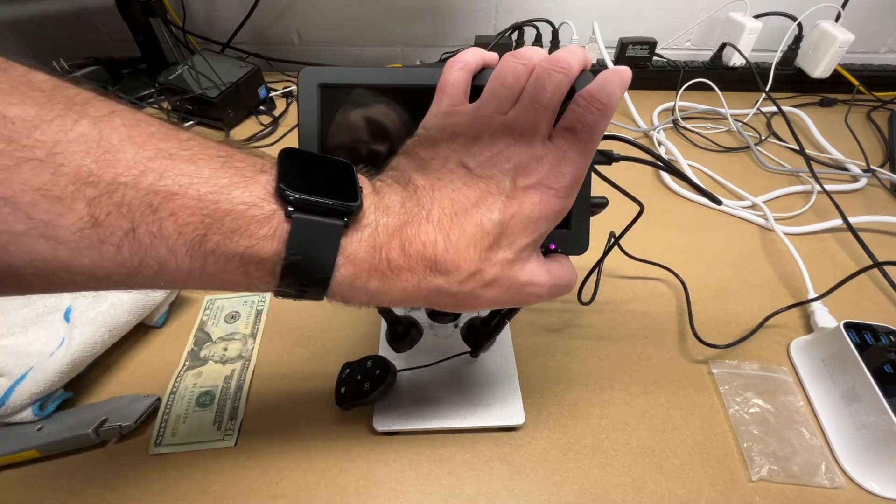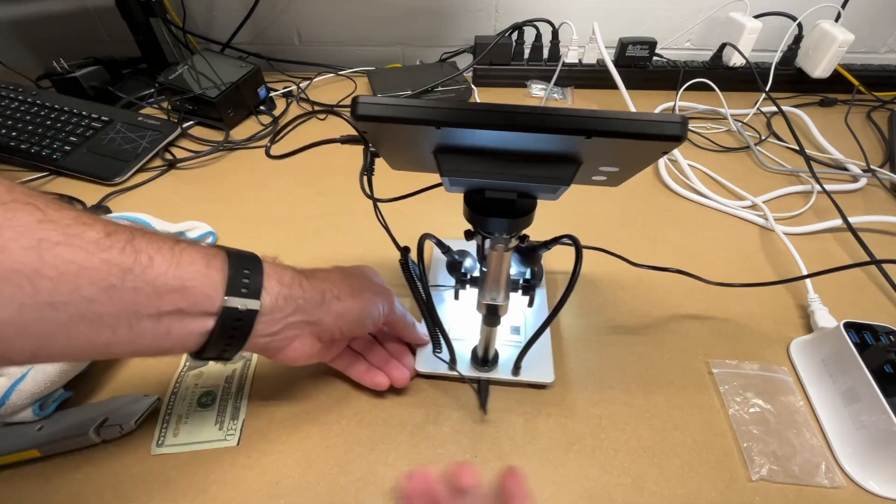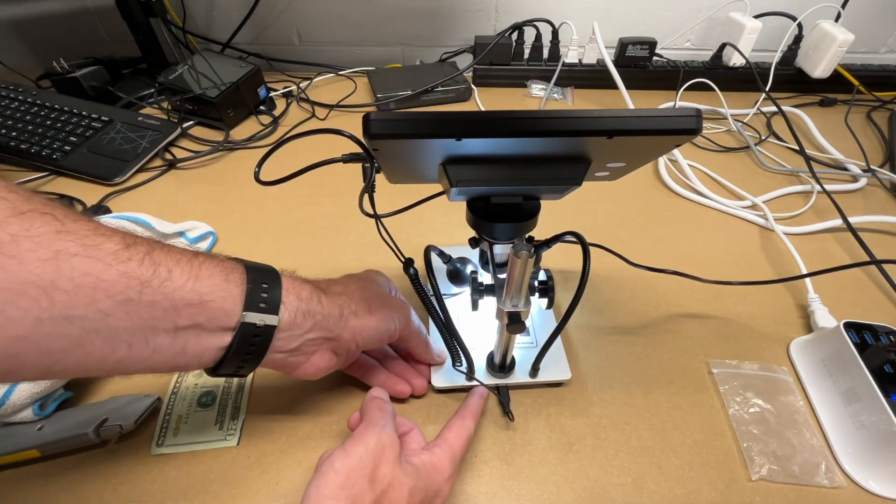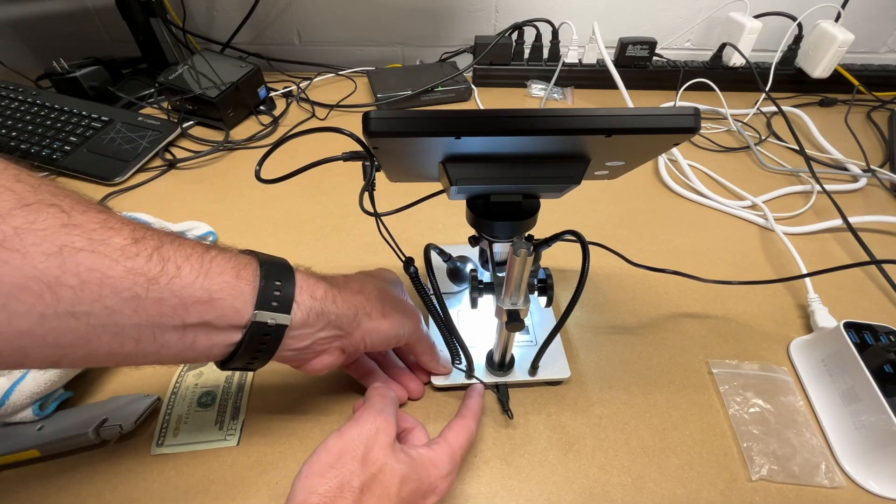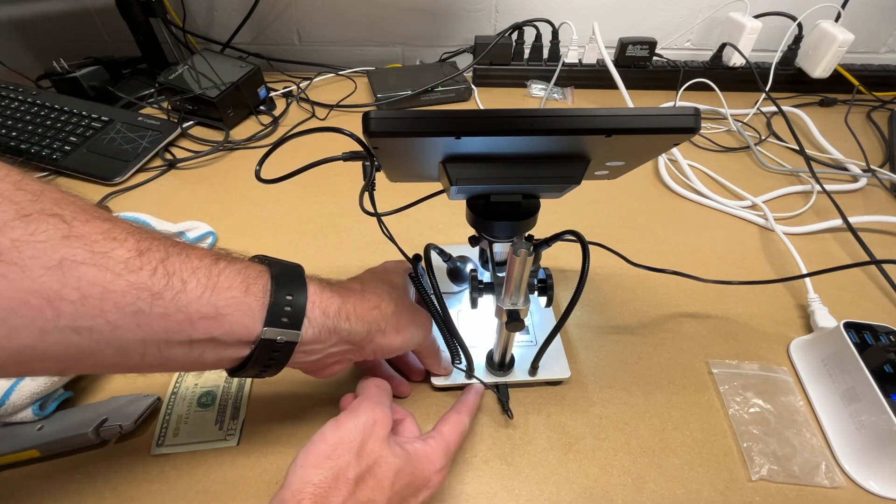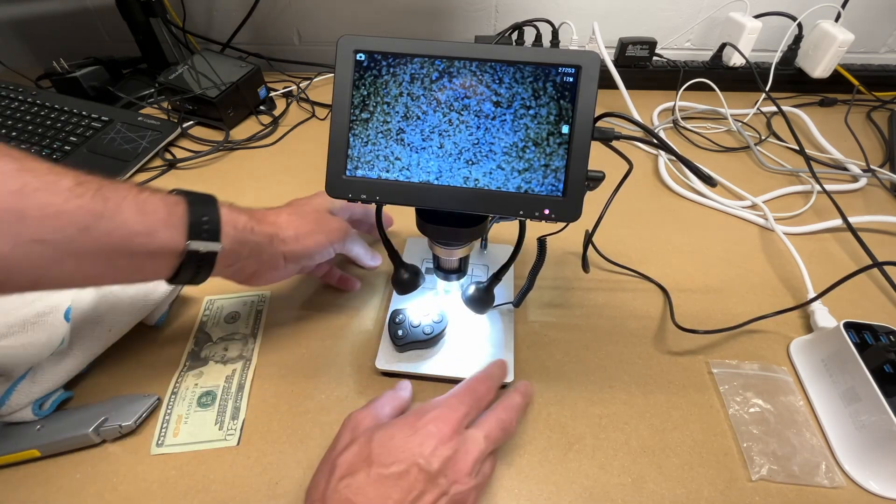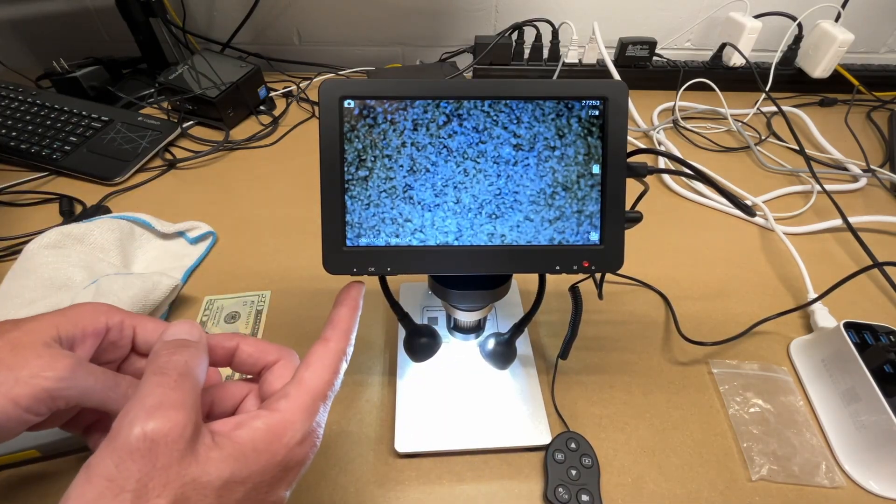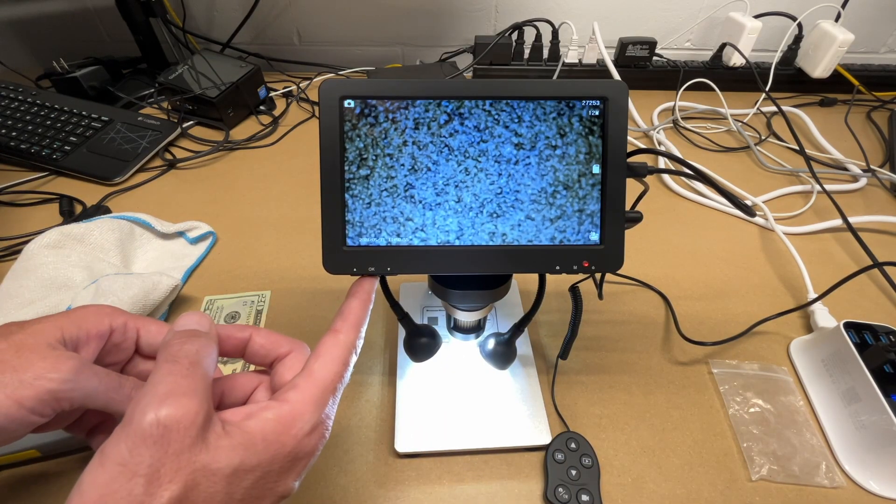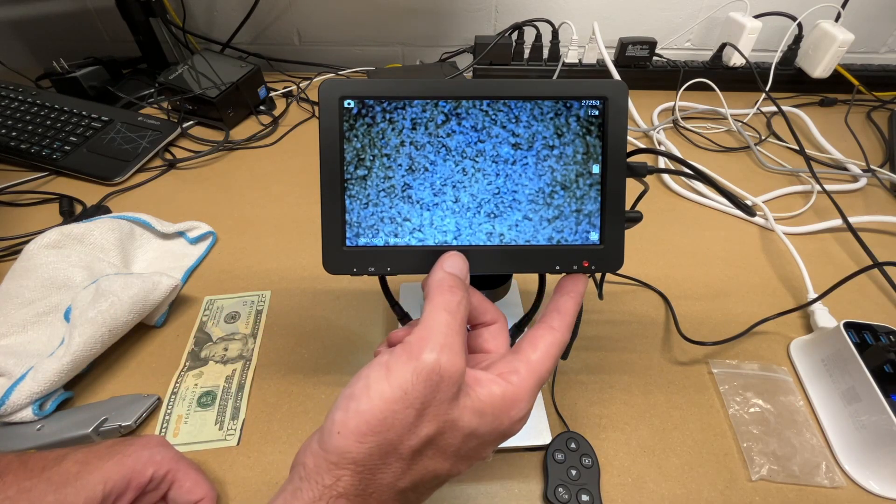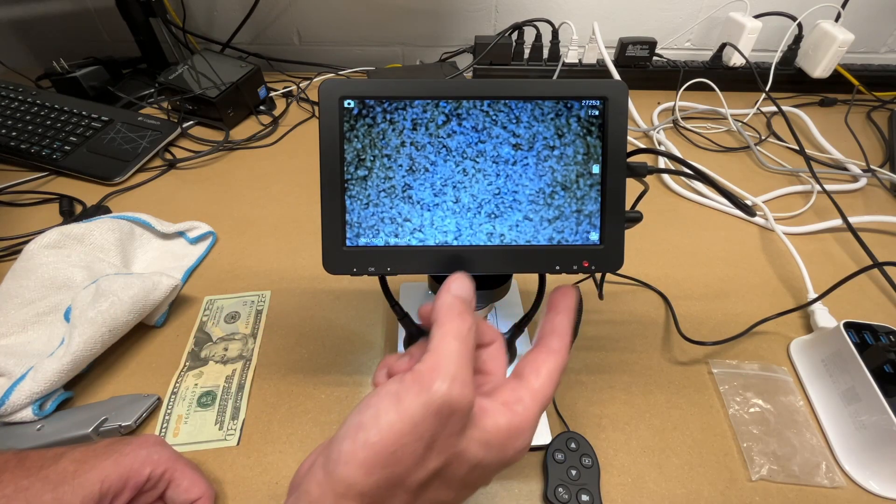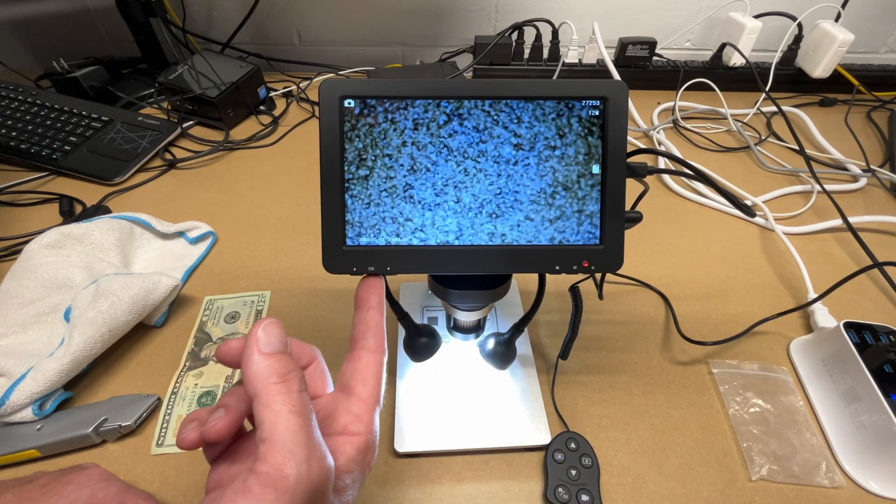To turn on, we'll hold down this power button. On the back here, we have a knob to turn the light up and down, the two side lights. So those are positionable lights. And then on the main screen, we have three buttons here. We have up, okay, and down. Then we have photo, menu, and power.